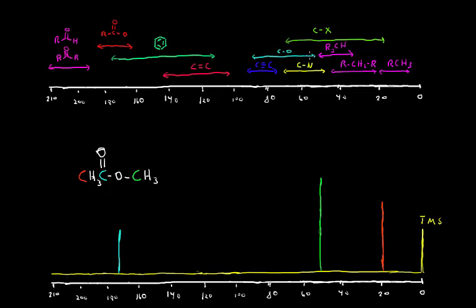Oxygen on average is more electronegative than most of the halogens except for fluorine, so carbons bonded to oxygens tend to resonate a little bit farther downfield. Nitrogens are a little bit less electronegative. Pi electrons, as we saw in proton NMR, tend to be even more strongly de-shielding. And so alkynes a little bit less so. Alkenes are out over 100. Aromatic carbons on benzene rings are in this broad range from about 110 out to about 180, in my experience.